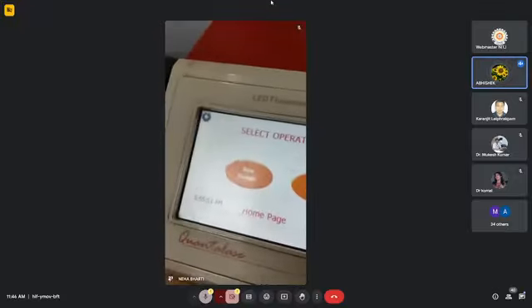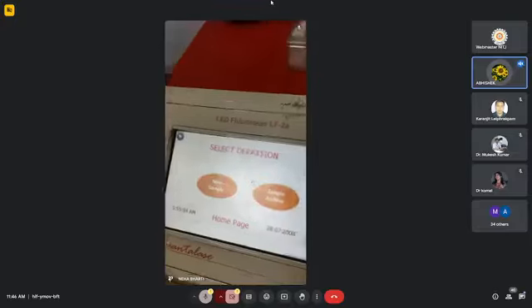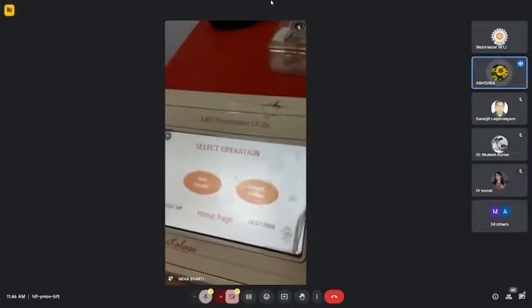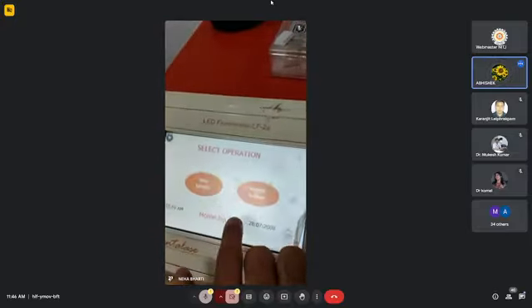As you can see, we are starting from scratch. Whenever we start performing measurement of uranium using this instrument, this is the view we get on our screen. So we tap on new sample.